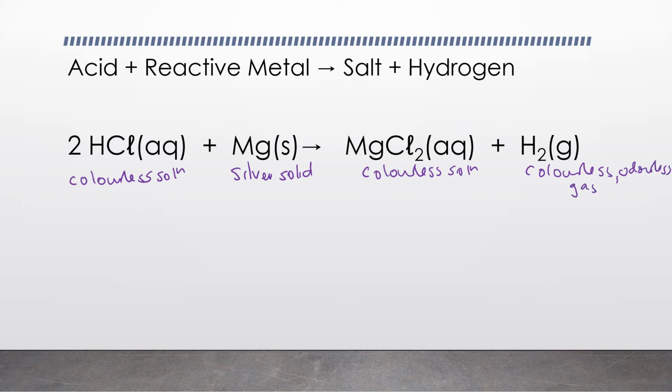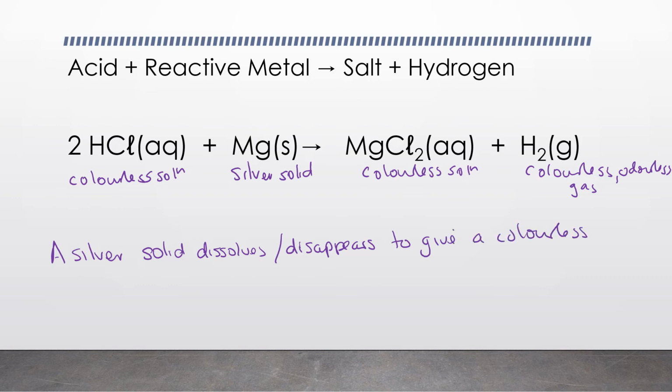So your observation would be a silver solid dissolves or disappears to give a colourless solution and bubbles of a colourless, odourless gas.